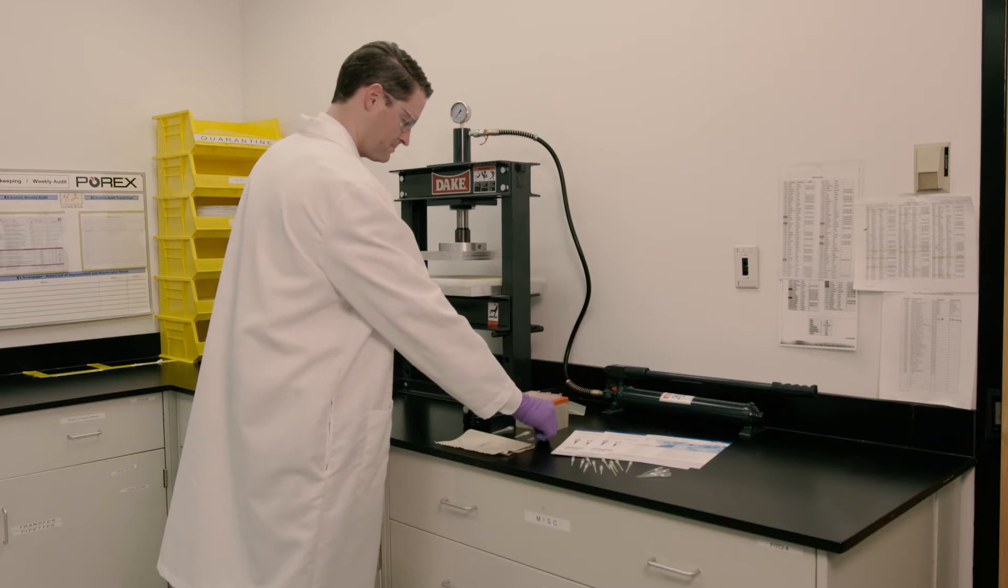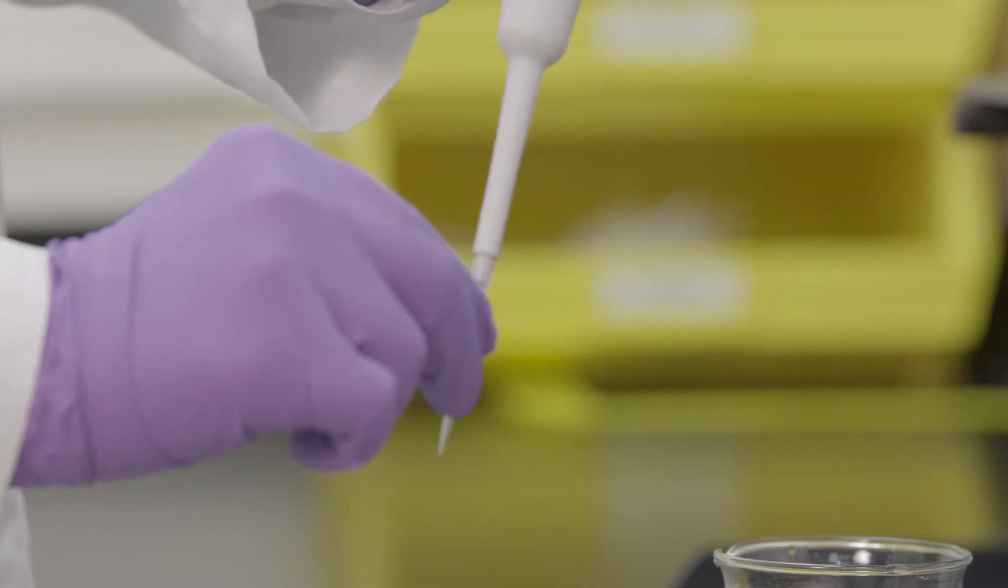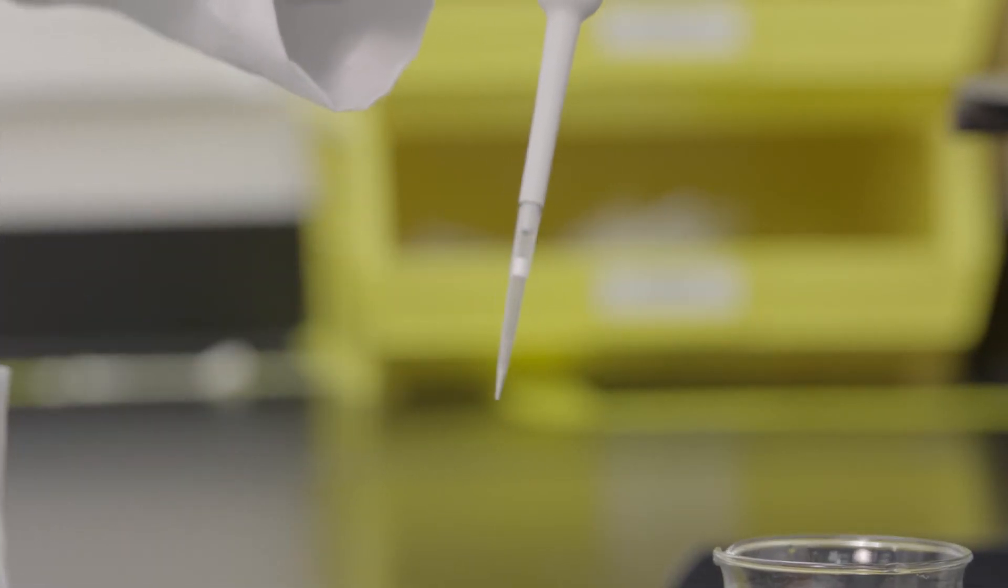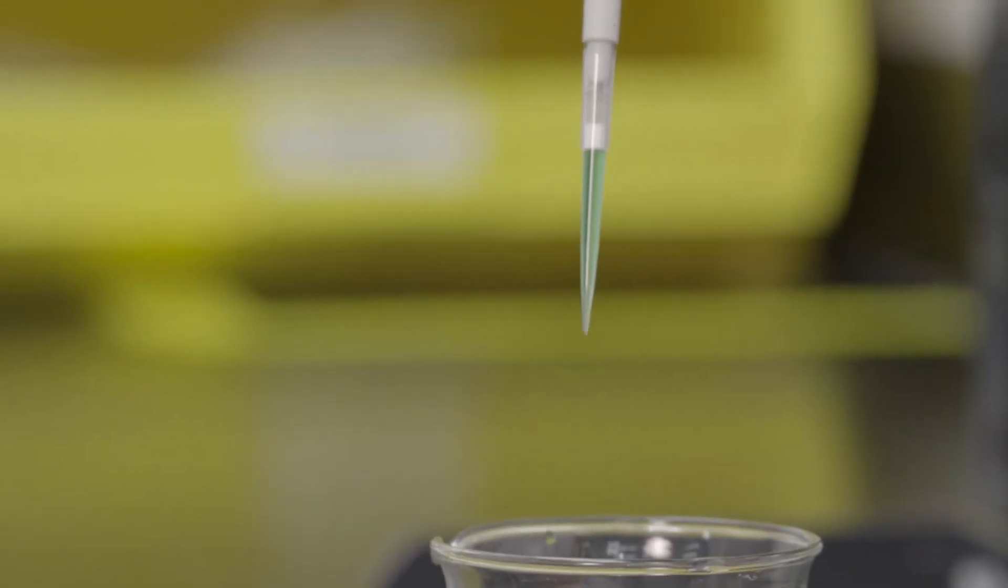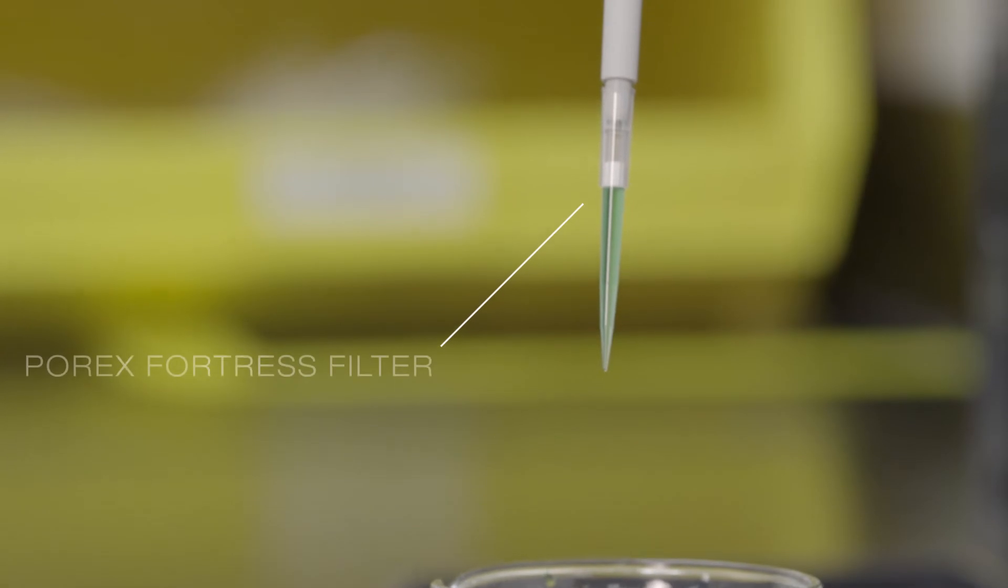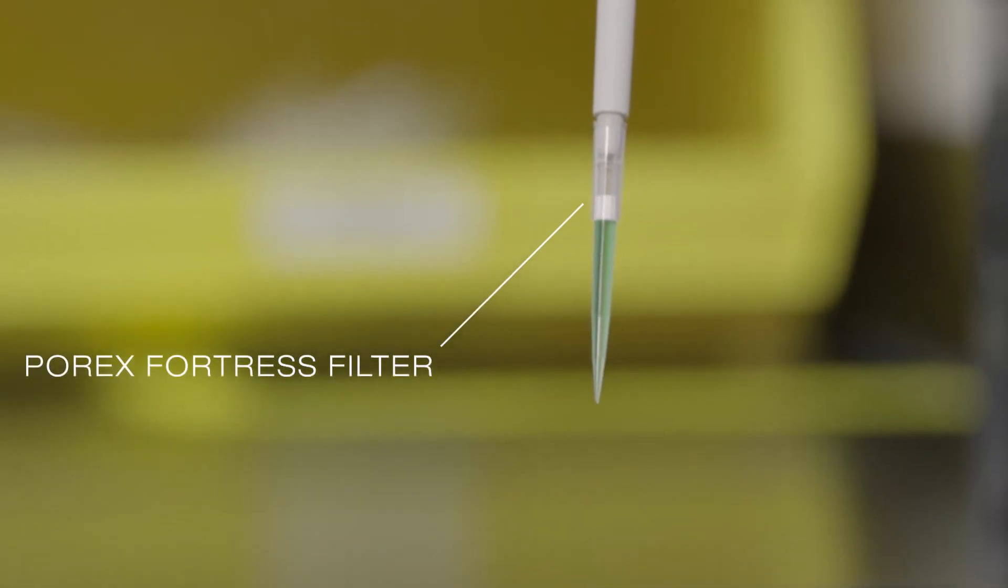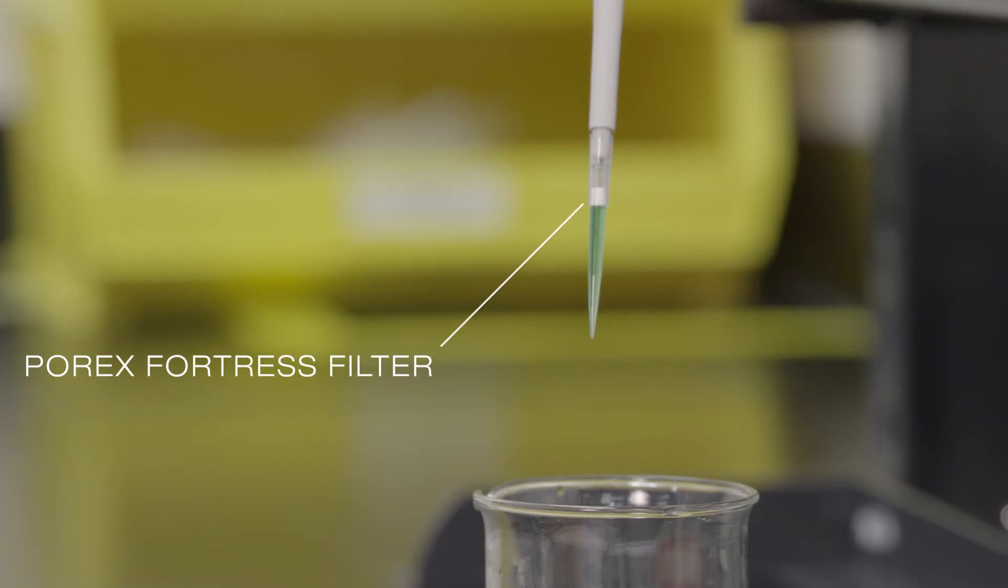The third demonstration is with the Porex Fortress filter. Watch one more time as we aspirate the 300 UL. Now, as you can see, the green sample does not go through the filter. The Fortress filter has stopped both aerosols and the green sample from getting through to the pipetter shaft.